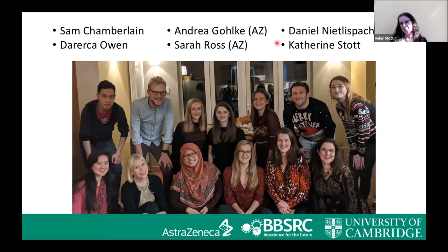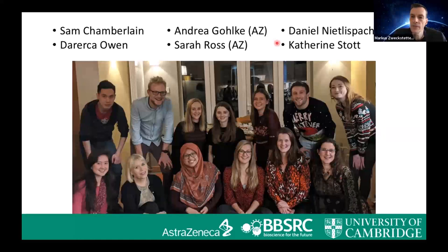Thank you. David, Eliza, great talk. Two questions. Did you have to label the farnesyl group for structure determination? And second, if you perturb the farnesyl binding site in the N-terminal lobe, do you still displace RAL from the membrane?